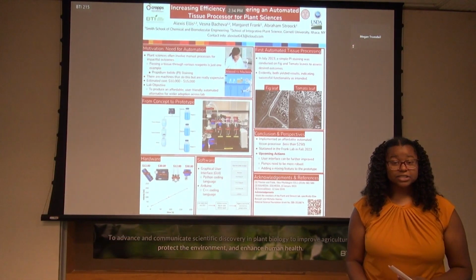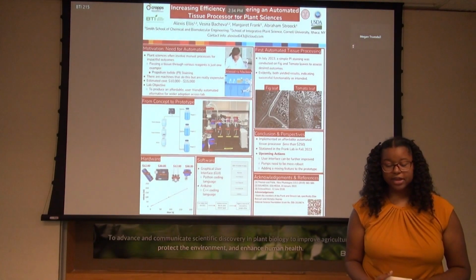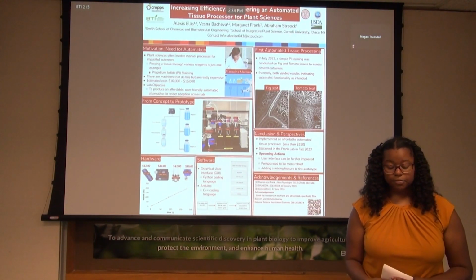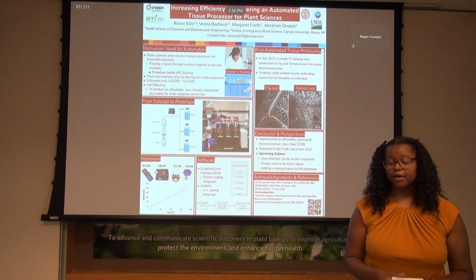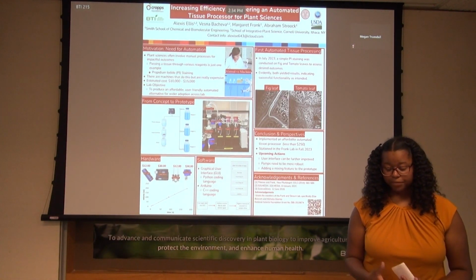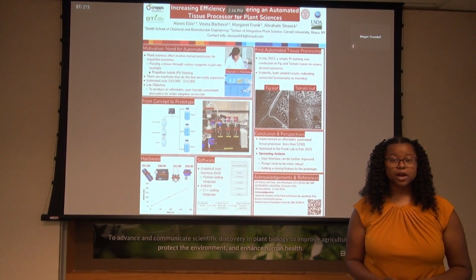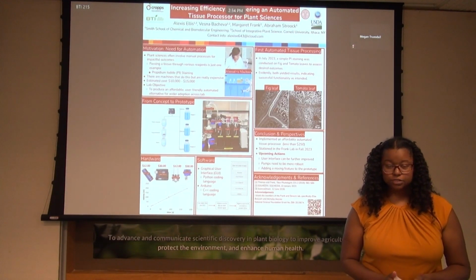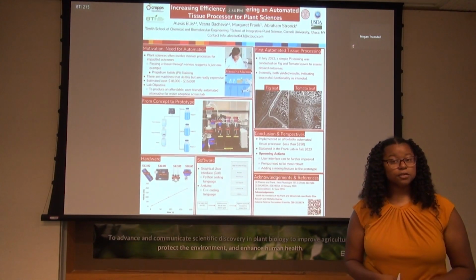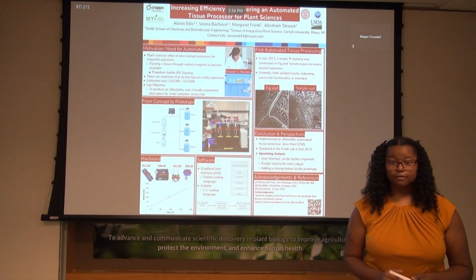And upcoming actions that this prototype can take are making sure that our pumps are more robust. Although it is linear, the pumps can work faster to receive the desired amount of milliliters that we want to produce, as well as adding a mixing feature to our tissue container to make sure our ethanol and our water never sit for too long together. And we can always further improve upon the graphical user interface to make it more user-friendly towards the Frank Lab members.